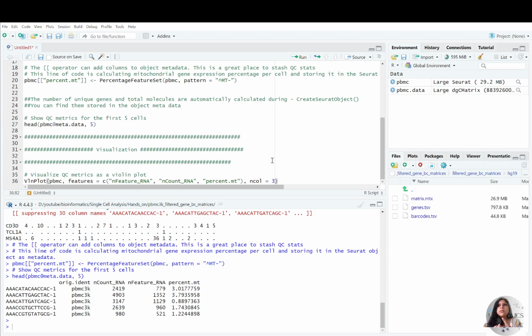You should know what a kernel density function is, and then you will come to know what a violin plot is. But a general explanation I'll give right now.